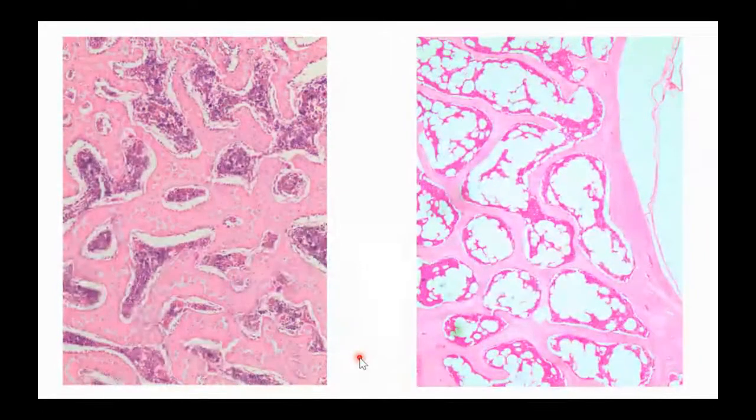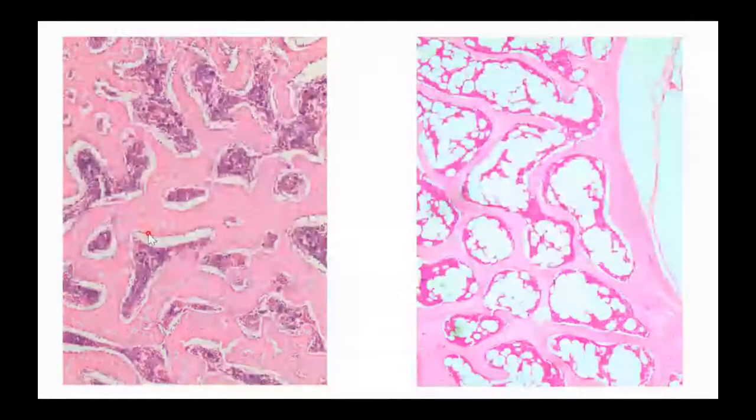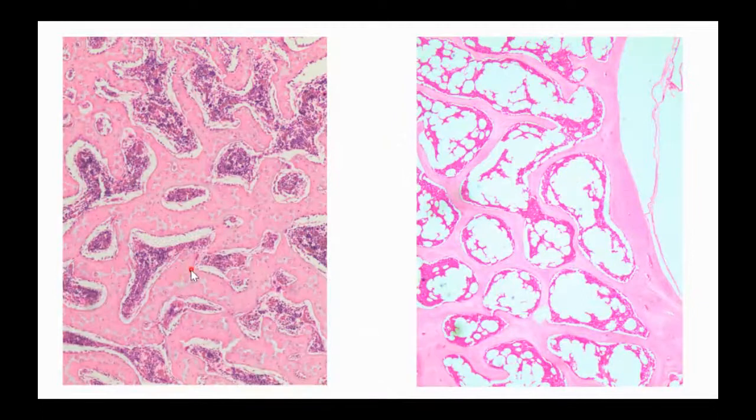Wanted to show you that some of my images of spongy bone also look a little bit different. So this is one that looks similar to what we just looked at. You can see the bone marrow that's mixed in over here in some spaces. Sometimes you'll also see that bone marrow look a little bit darker in color. So in this case, the purple is my bone marrow, and you can see those trabeculae a little bit bigger. You can also maybe see the osteocytes a little bit bigger on this one. Both of these are what my spongy bone looks like, with space in it for that bone marrow, and then the bony structure itself that's shown here in solid pink.